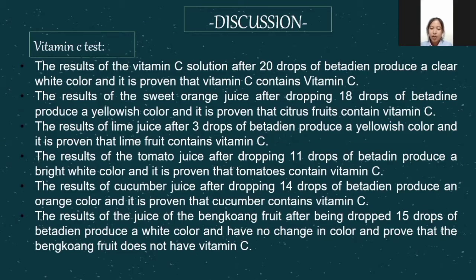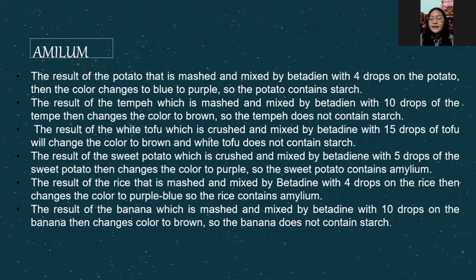The result of the bengkoang fruit after 15 drops of betadine produced a white color that doesn't change, giving evidence that the bengkoang doesn't have vitamin C. I give it back to the moderator. Okay, next, Meisya will explain about our discussion.